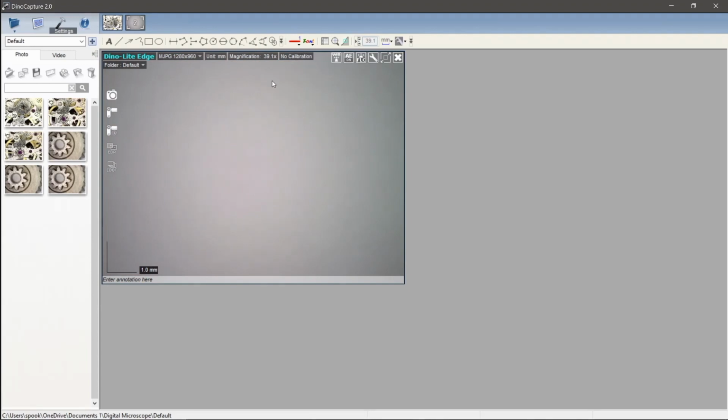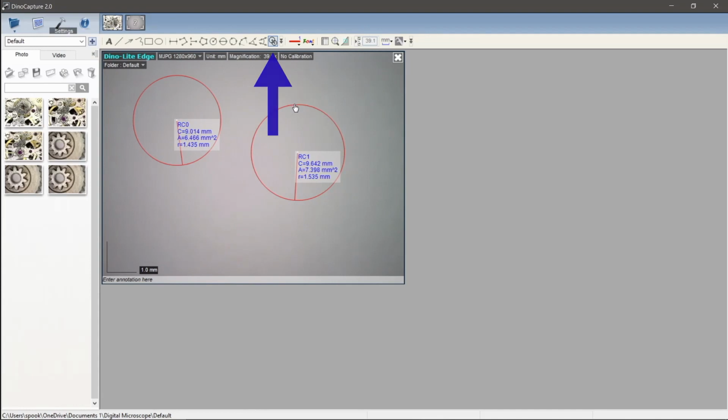Next, we have the center distance tool. To use this tool, I have 2 different circle measurements. Just draw out 2 random ones right now. I can click anywhere on this circle and then anywhere on this circle, and then I will get the distance between the center points of each of those circles. And that works with all of our different circle measuring tools.